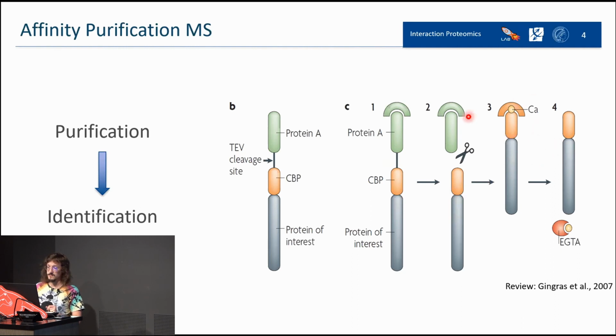Then we wash again everything in order to remove any unspecific binder that attached to protein A, and we selectively use this calcium binding protein to then select the specific binder.